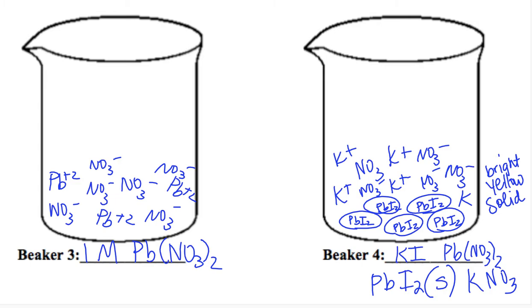When I put this in here, will I get a light? A dim one? So there wasn't a light before, but when I put the sugar in, you're saying I should get a dim one. It's not because of its carbon. It's because why? It's a covalent compound.